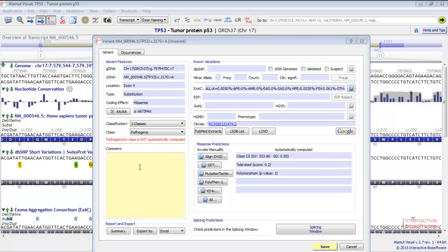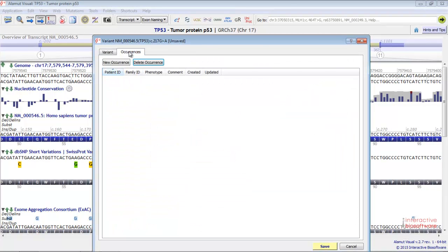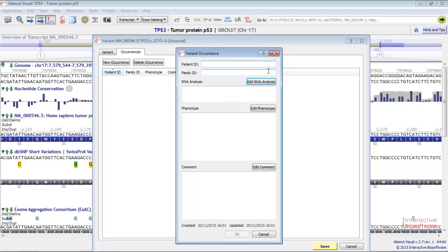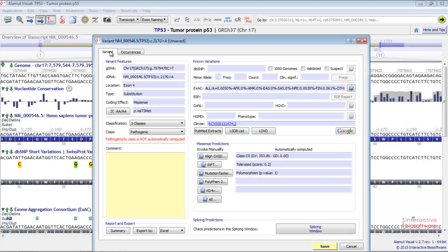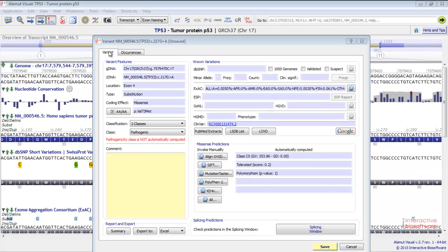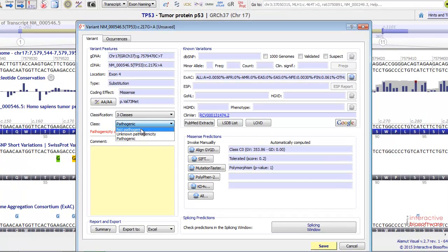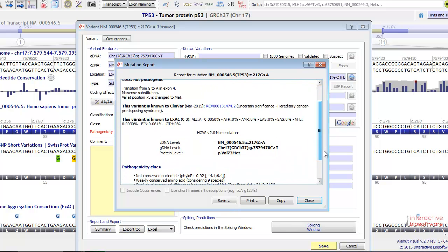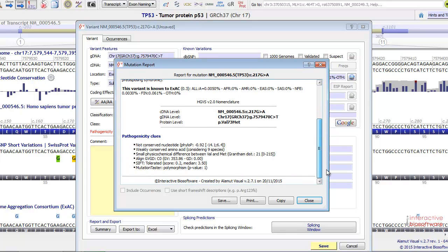You can write some comments here. You can also create some occurrences for each patient to indicate the patient ID, the family ID, and any relevant information regarding this patient. Let's choose not pathogenic here. By clicking this button, you'll have access to a detailed mutation report including all the relevant information that will help you decide about the variant pathogenicity. You can save it, print it, or copy it.